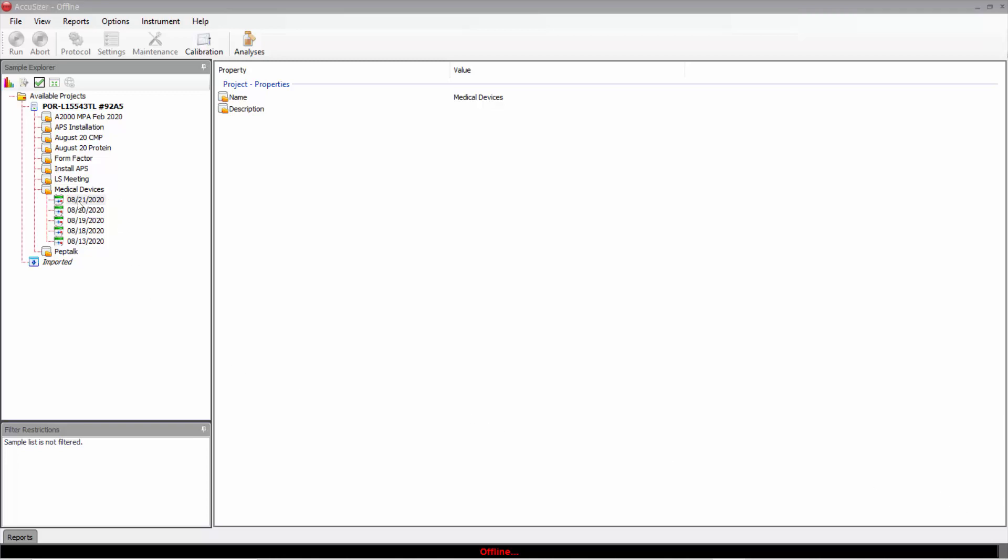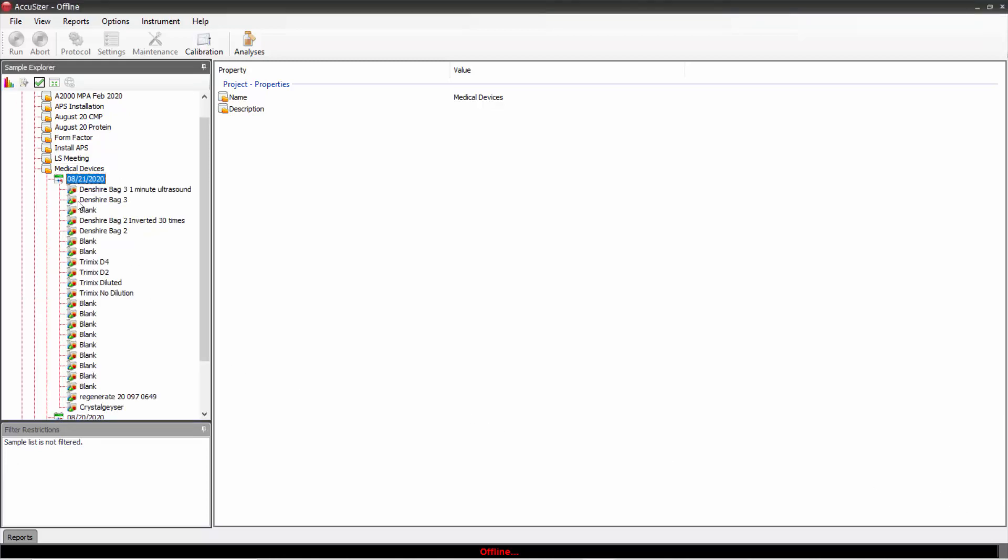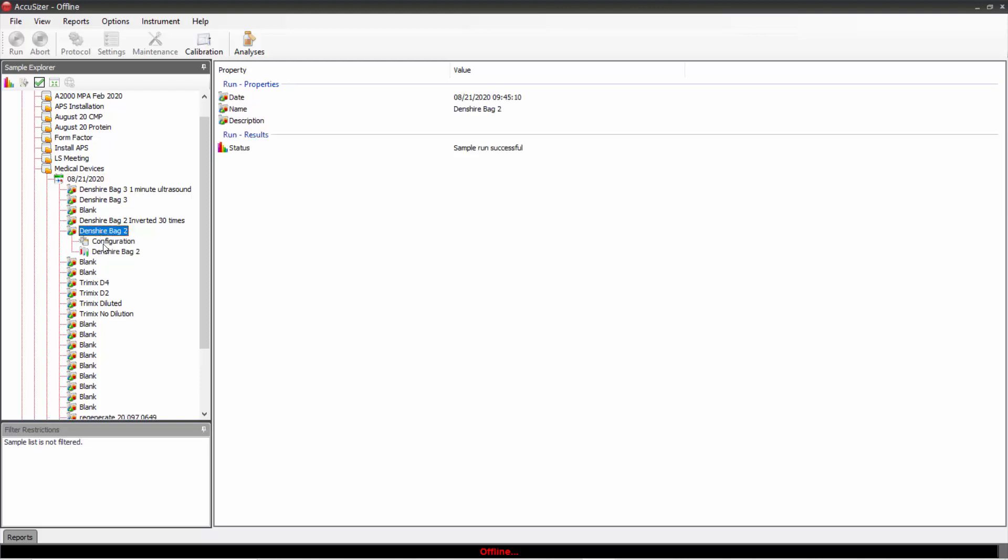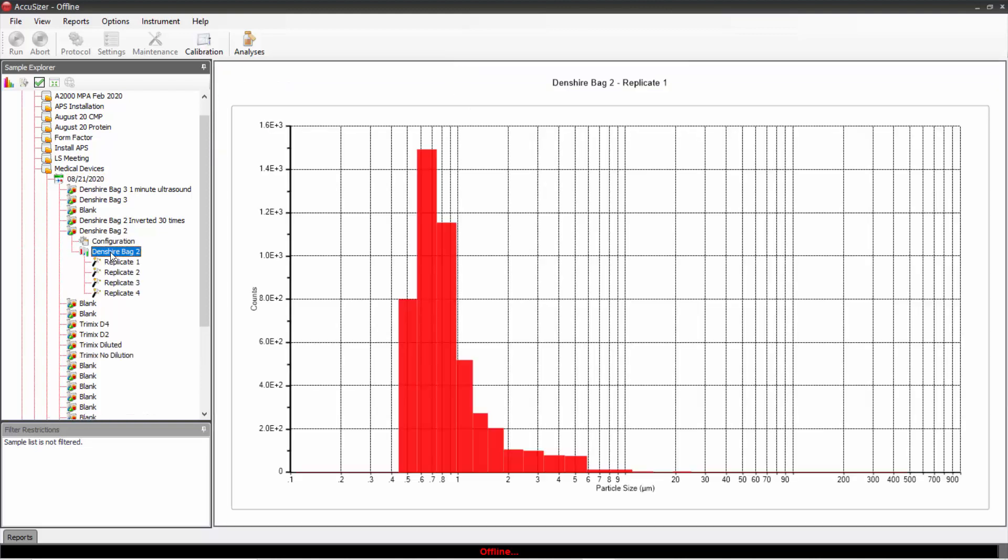first, find the results we want to generate the report for. Here we see there are four results, and we want to perform the calculation and create the report for replicates two through four.